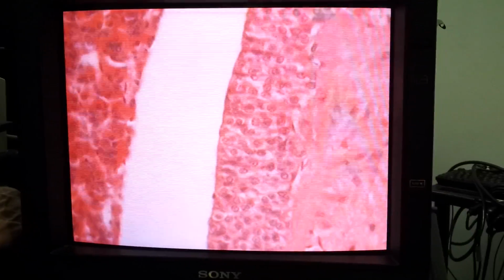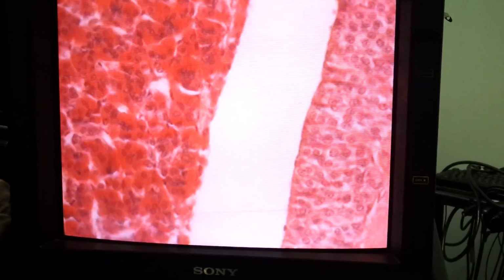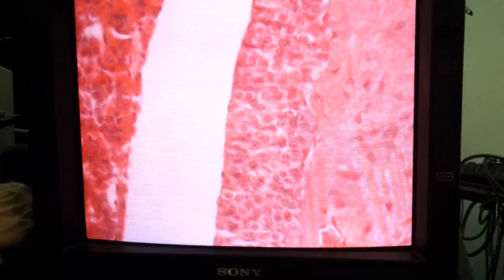But if we get into a high-powered look, I try to give you as much context as possible, just like when you draw them. So it would be something like this, where you can actually see some context for not just all anterior.